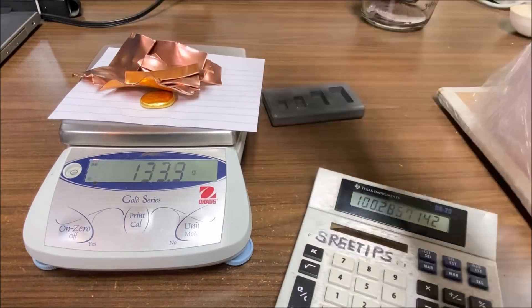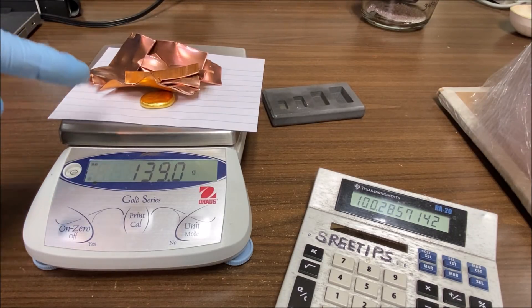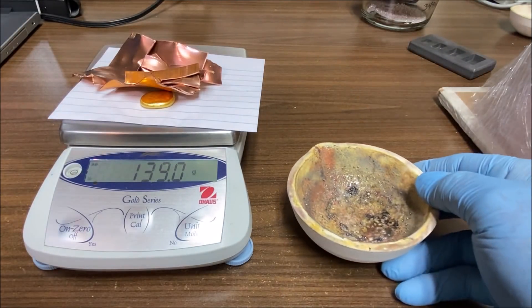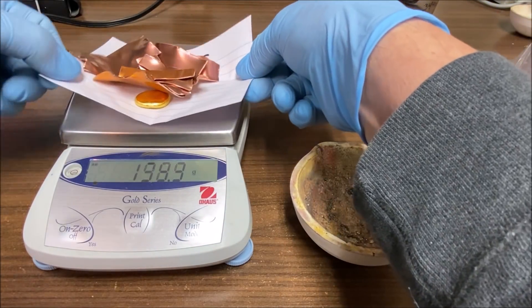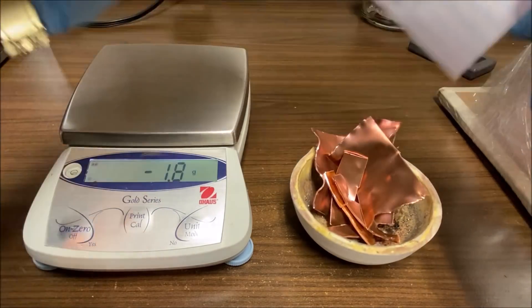I've got 100 grams of copper pre-measured, so we're going to add that and you'll see we end up with 139 grams of material. Once we alloy these two together it will produce a 28% gold alloy. I'll transfer the metal into a melt dish and we'll go out and melt this up and make our gold alloy.